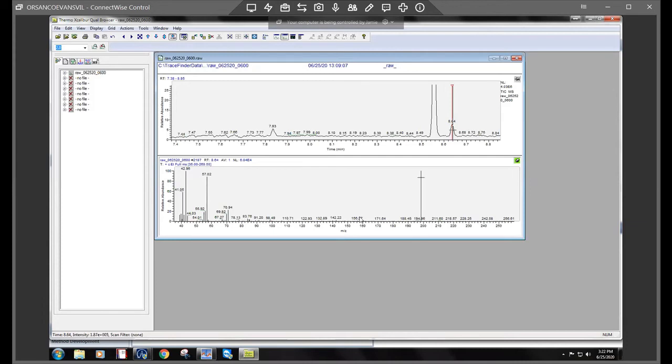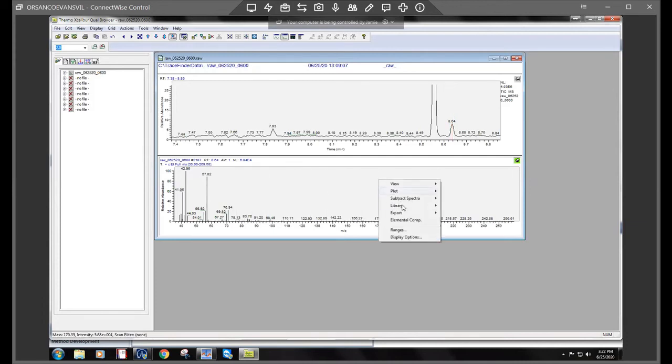Okay, we clicked on that. We come down to the spectra here, right click, go to library and search.